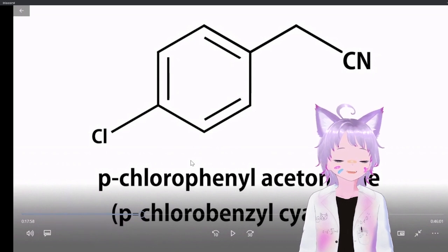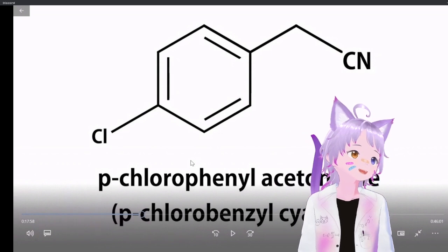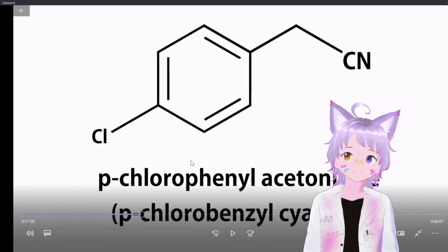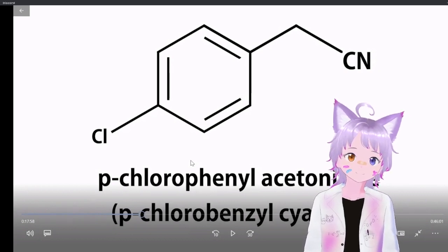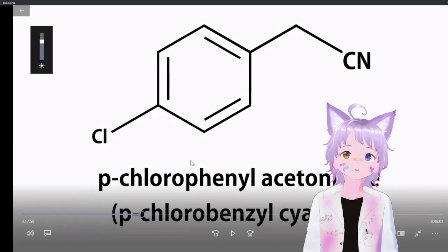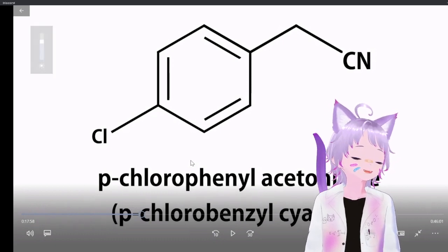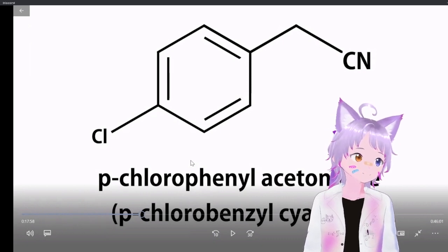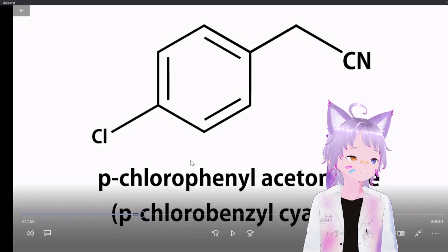No, I'm not talking about wavelength. I'm talking about watts. We're not gonna be able to get 200 nanometer light through borosilicate anyway. Even if you get a UVC light source, only the UVB is gonna pass through. So it would actually work if we use a germicidal tube, but we'd be wasting a lot. Well, to be honest, the UVB lamps are literally just UVC lamps with a coating, if you think about it. So if you use a UV.